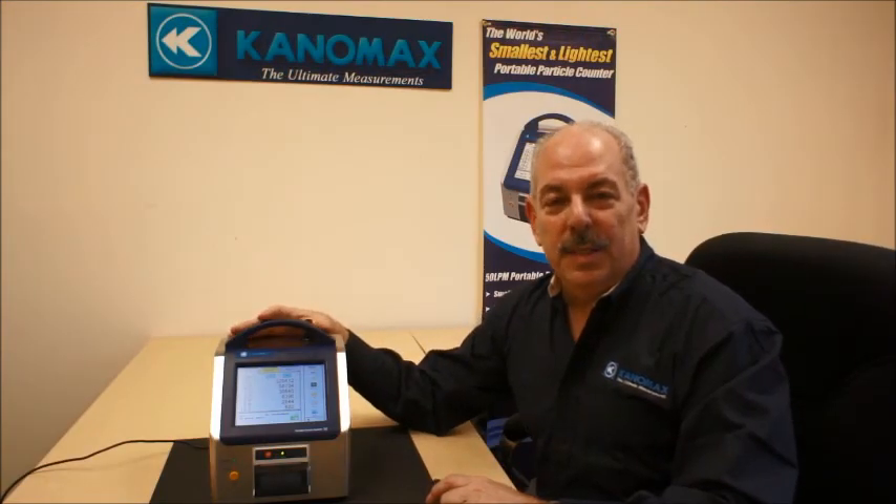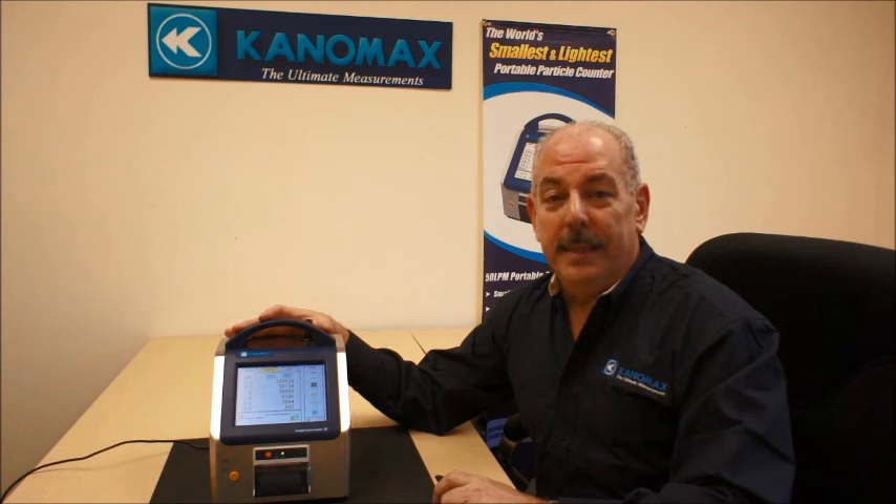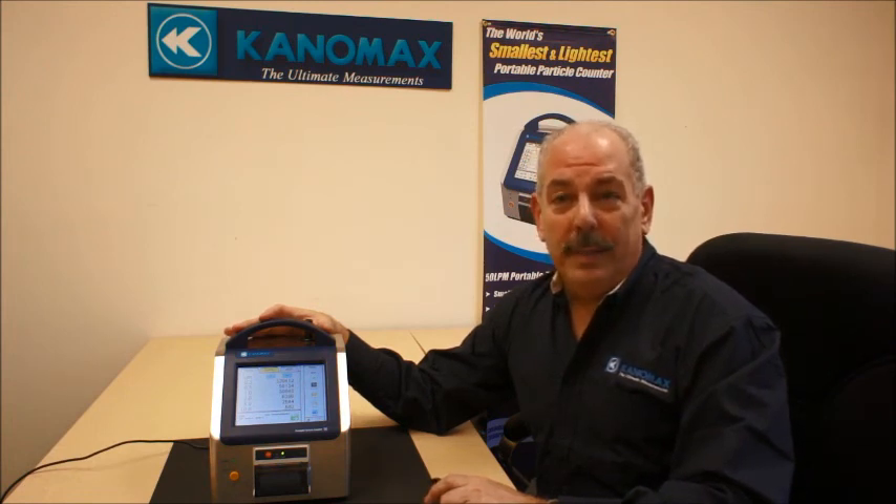Again, the unit is the smallest and lightest in the industry — 28.3 liters per minute and 50 liters per minute. It is 21 CFR compliant and comes with a two-year warranty. Please give us a call if you have any questions — we'd be glad to service your account. Thank you very much.